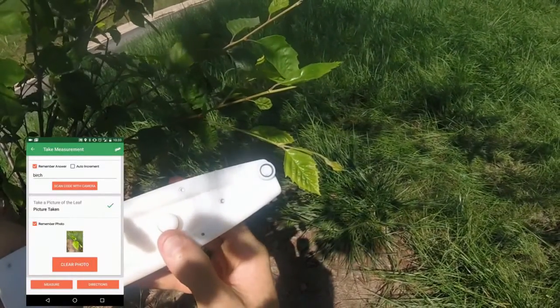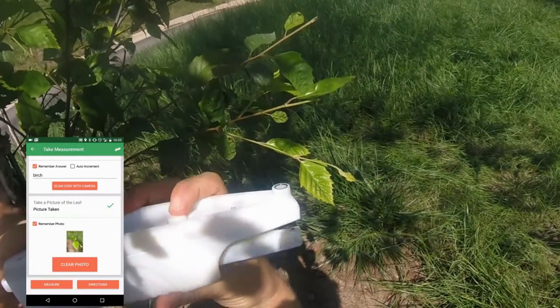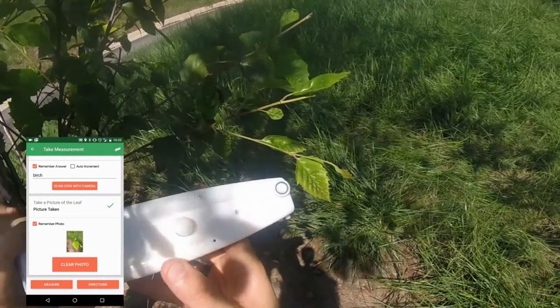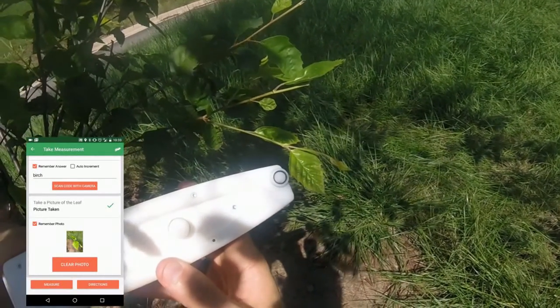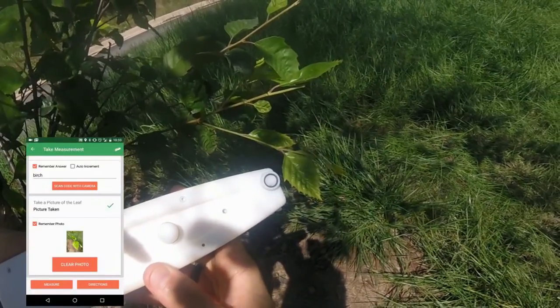5. Finally, plants adapt to light conditions in seconds or even milliseconds. Open and close the clamp quickly. Try not to shade the leaf with the device for long before beginning the measurement. Note: for this protocol, you must open and close the clamp for the measurement to start.